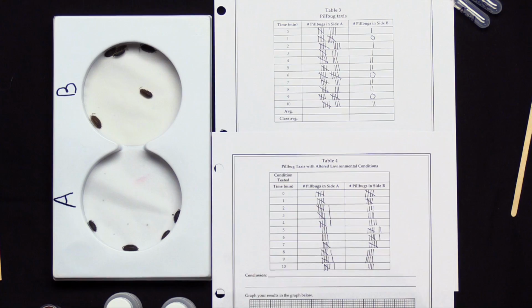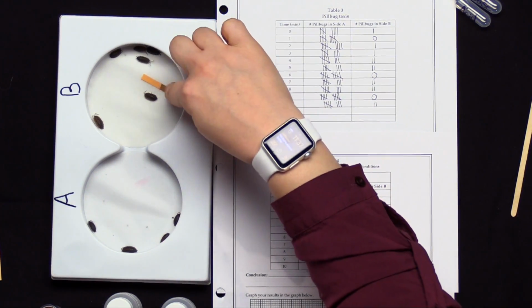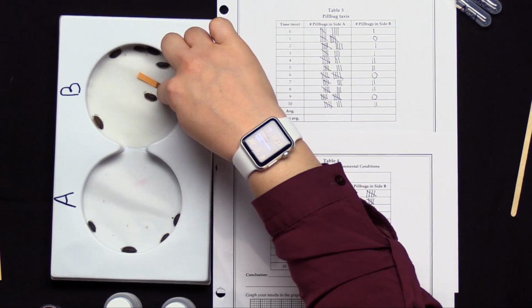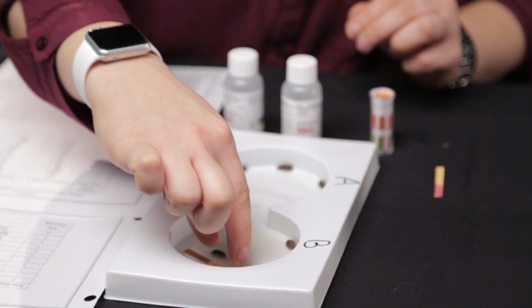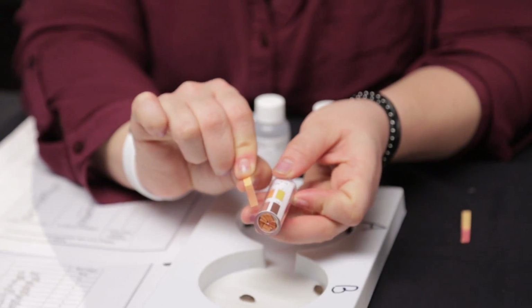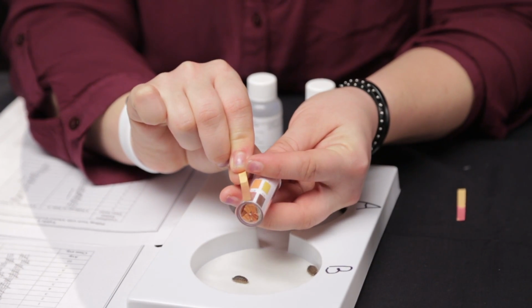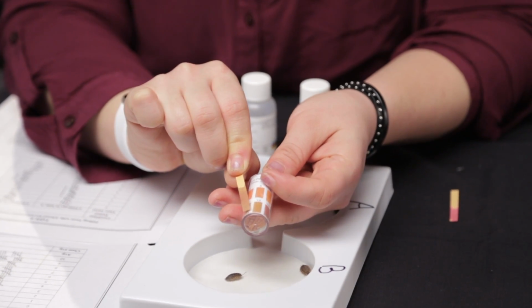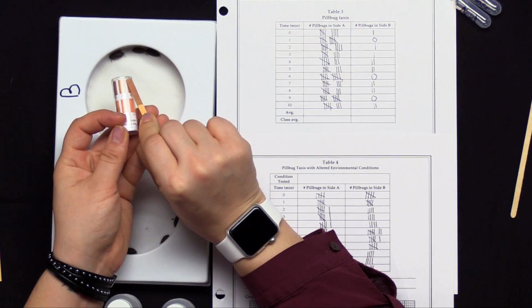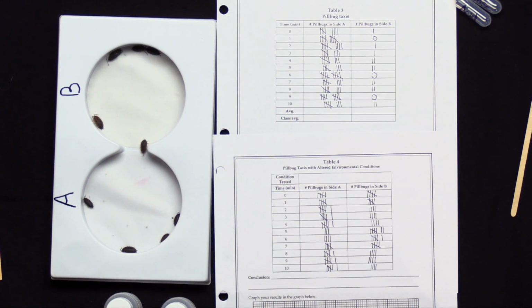Let's double check our base side just to see. And I can tell you already the color it's turning means that this is definitely basic. And if I compare this here, I'd say that's maybe a solid 12, maybe a 13, 12 and a half or so, which means that side was definitely basic. So we at least had our variables right. We can confirm that we did the experiment right, and it's just up to the pill bugs and their behavior and whichever they decided to prefer.